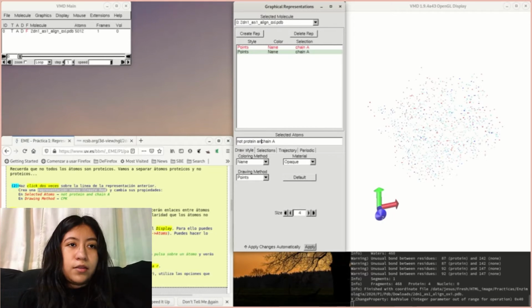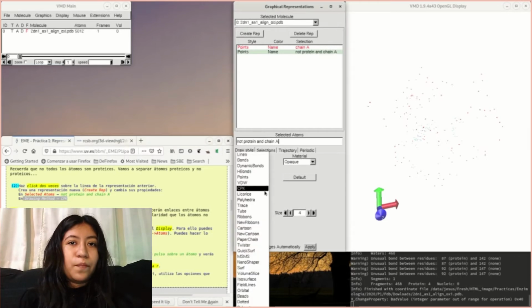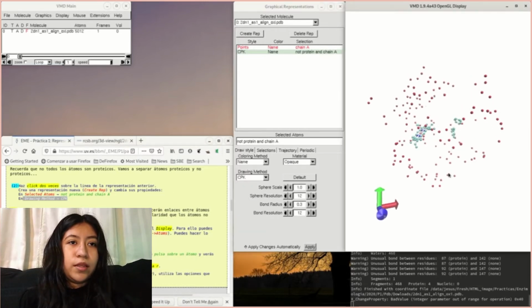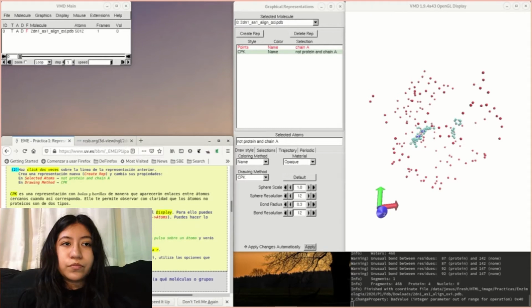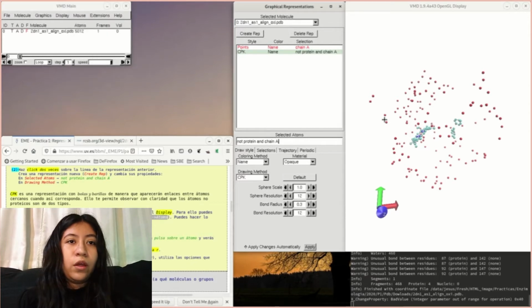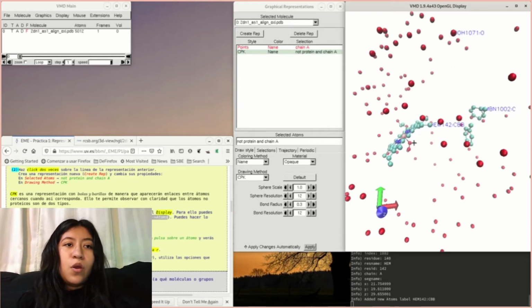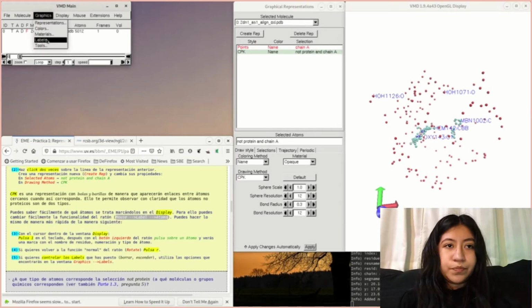You can easily find out which atoms there are by labeling them in the display. For this, you can change the mouse functionality to Label Atoms. You can do the same more quickly in the following way. With the cursor inside the display window, press 1 on the keyboard, then with the left mouse button click on an atom and you will see a label with the residue name, numbering, and atom type.